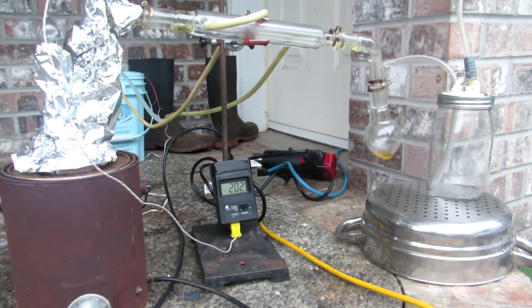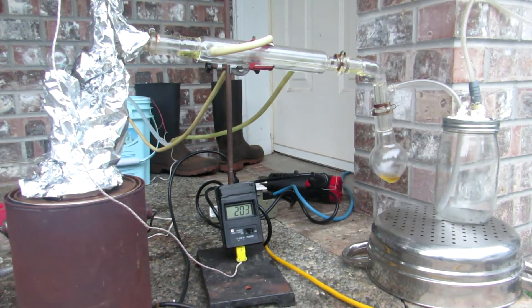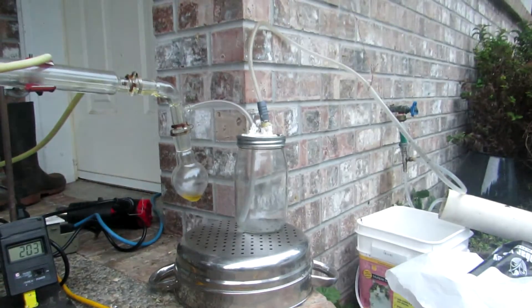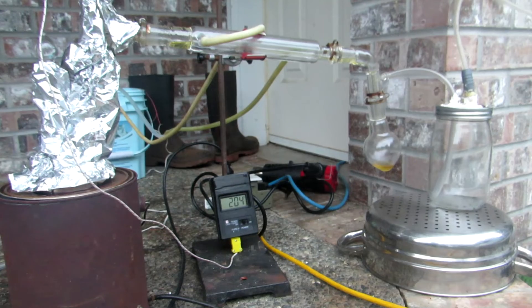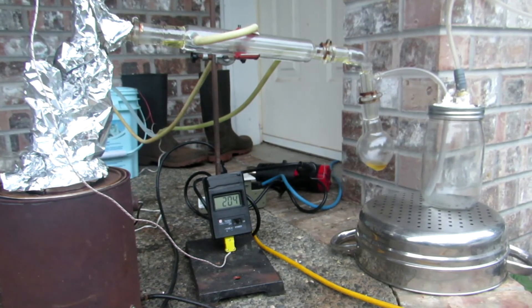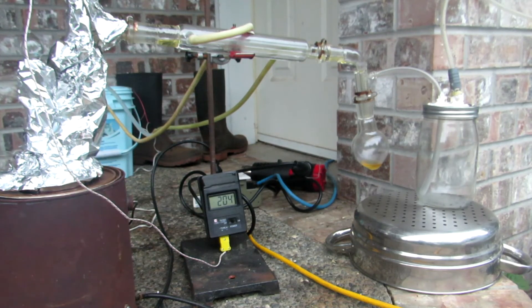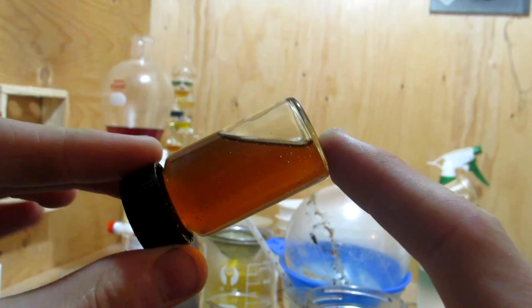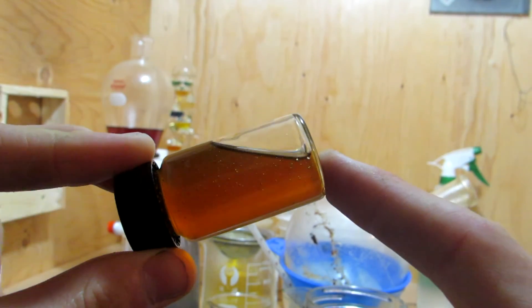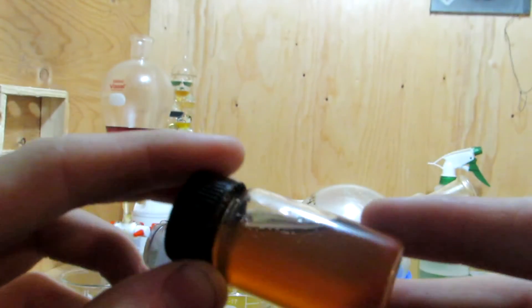The methanol was boiled off, and then the glycerol was added to a simple distillation apparatus to perform a vacuum distillation. A vacuum aspirator pump was used to pull a vacuum on the apparatus, and the glycerol distilled over at around 204 degrees Celsius. This is significantly lower than the atmospheric boiling point of 290 degrees Celsius, which is great. In total, we received around 10 milliliters of glycerol. Unfortunately, some of the impurities still carried over; however, the product is much more pure than before the vacuum distillation.